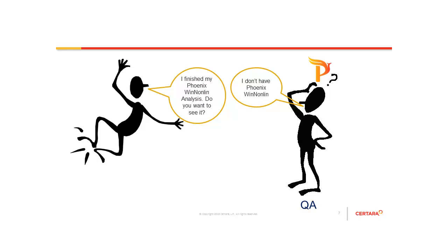If someone doesn't have access to Phoenix, you can still provide them with the entire project contents in a single click. Let me show you how to do this.